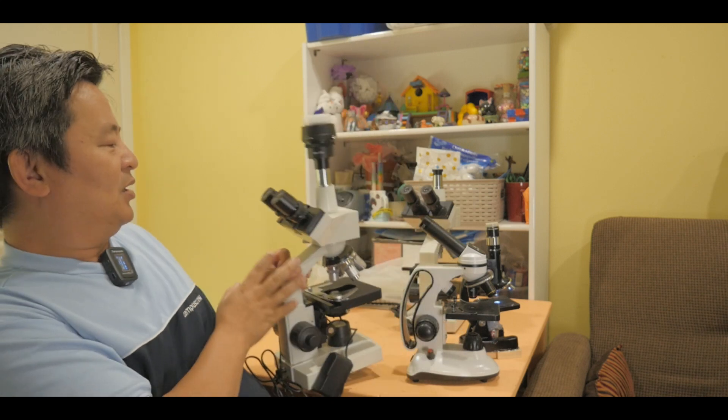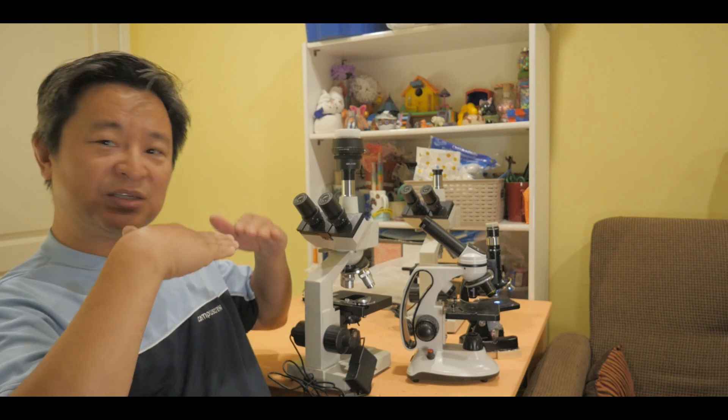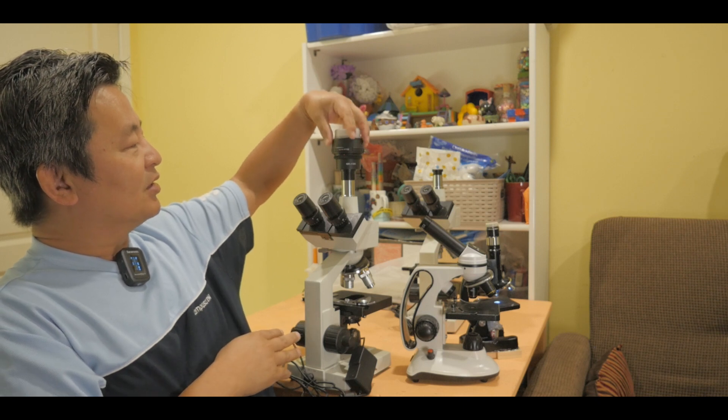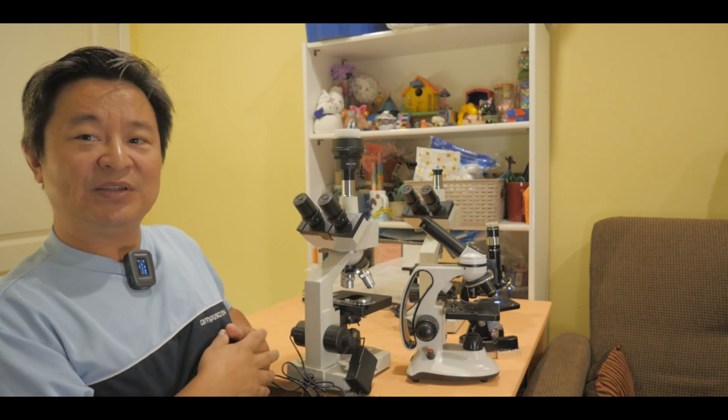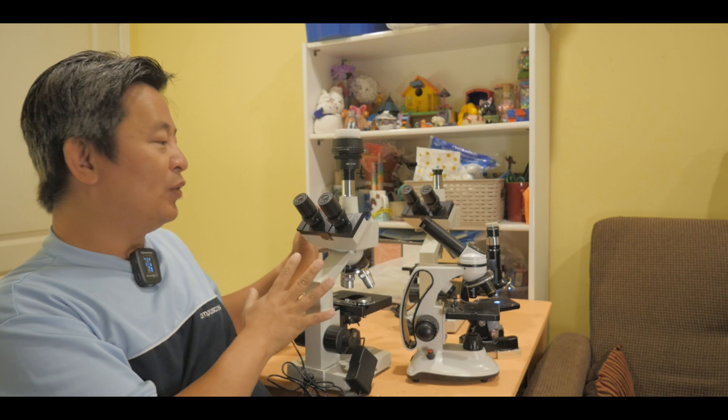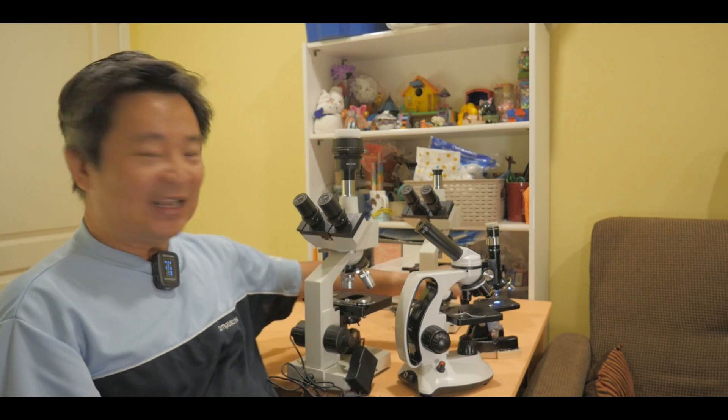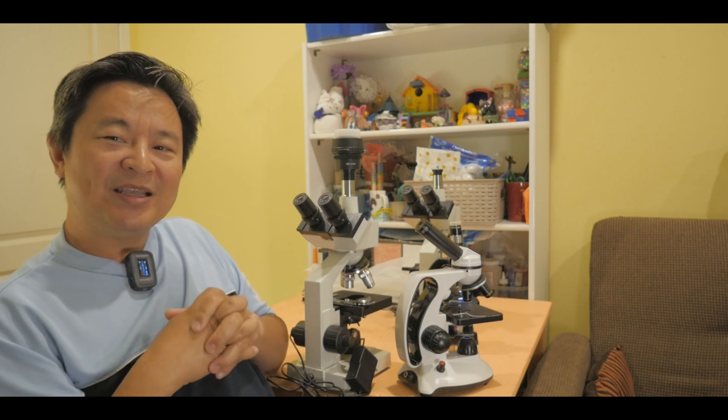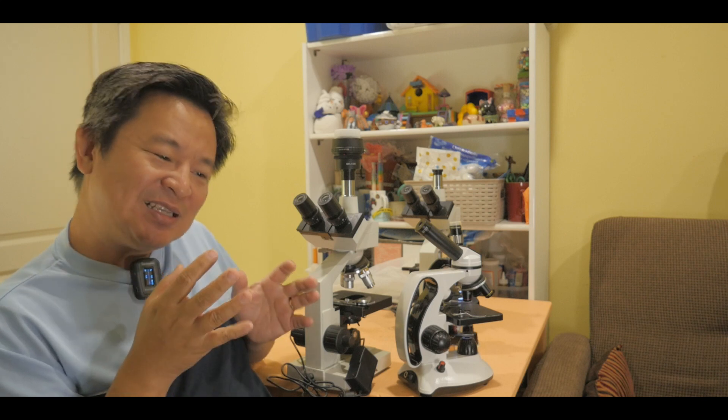In addition, you can see that this microscope actually have a coarse adjustment knob and a fine adjustment knob, allow you to really focus on the image, right? To get a sharp image. In addition, of course, you have these two ocular lens that give you that stereoscopic view of the slide. You might even see that kind of like three dimensional image on the slide. And what I like about it is that you can install a camera here, DSLR camera, mirrorless camera into this microscope and allow the class to see it. Of course, you know, you're paying a lot for this type of microscope that you're looking at a full $500. So yes. But I would say I rather have two of this than eight of this.